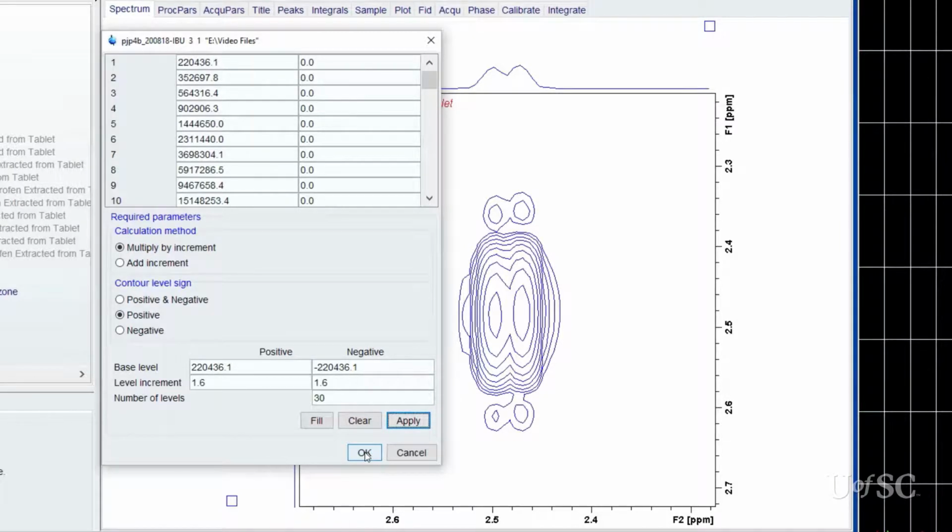The defaults left by Icon NMR processing usually have large spacings with too few levels. The best contour settings could be different depending on spectrum type, the displayed chemical shift scale and the peak widths. Also note that this only controls the interactive display in Topspin. The plot editor will have similar control for output that is separate of these controls. When you are satisfied with the contour spacing, exit the panel with the OK button.